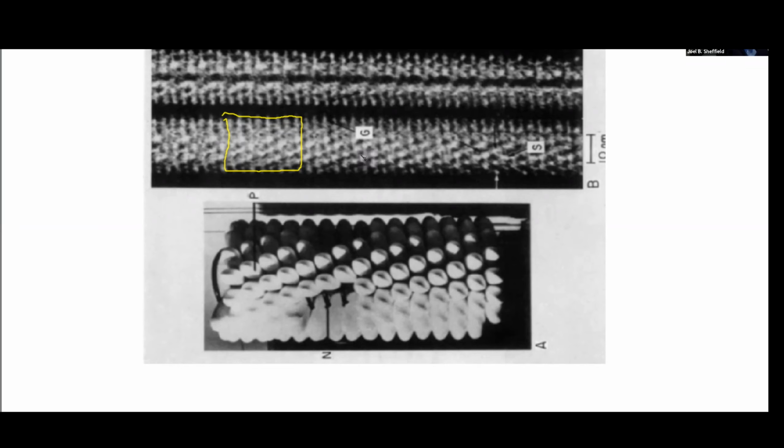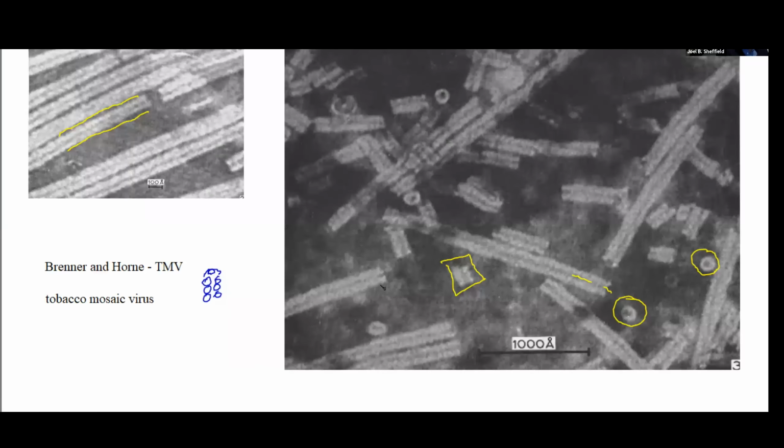What happens is you preserve the data component, the things that repeat, the things that are built into it, and you get rid of the noise so that you actually end up cleaning it up. This image was actually prepared that way so that it's much cleaner, say, than these images. There's a lot more detail in them.